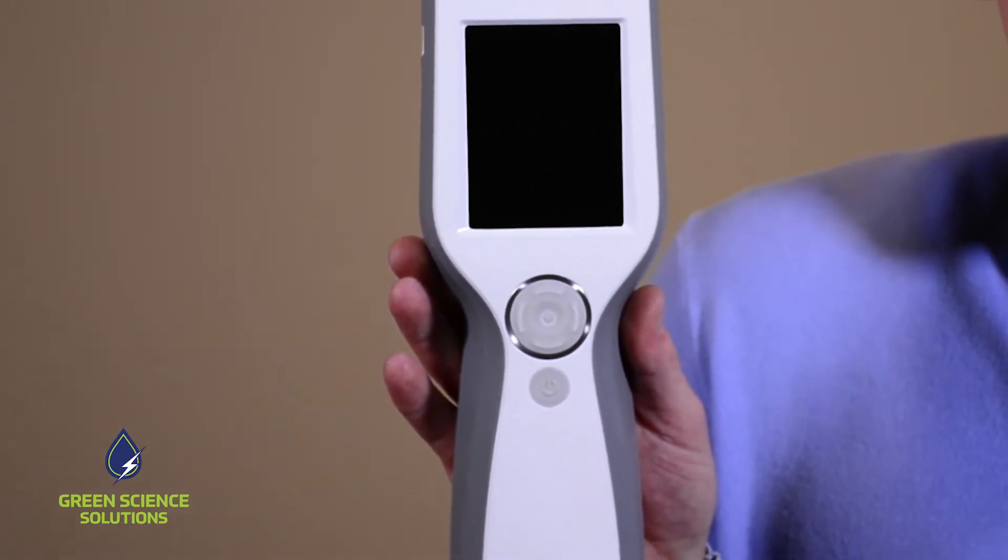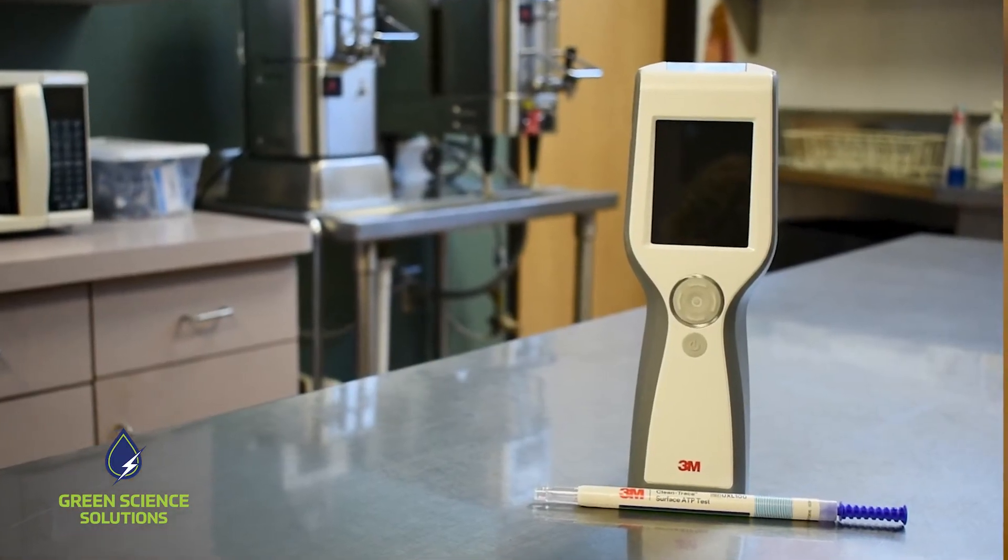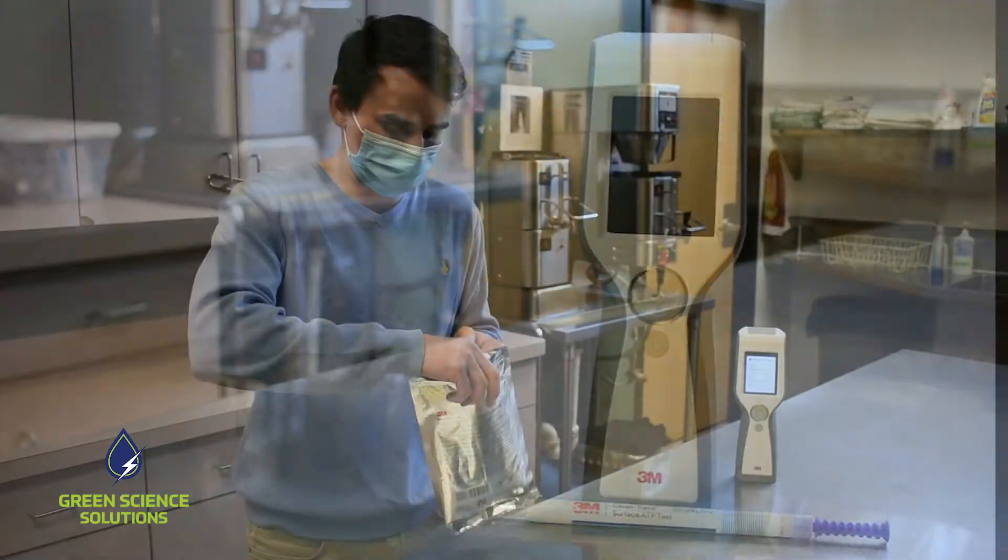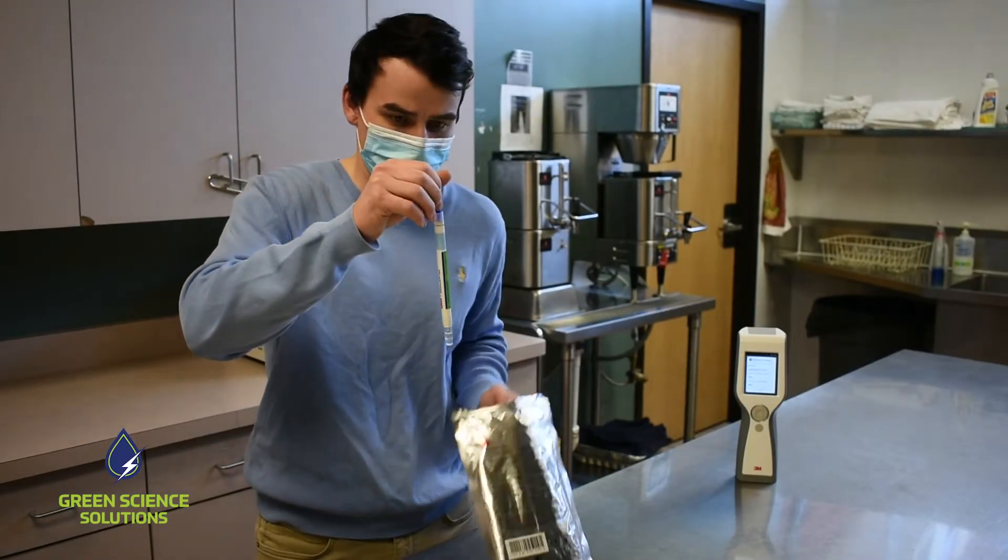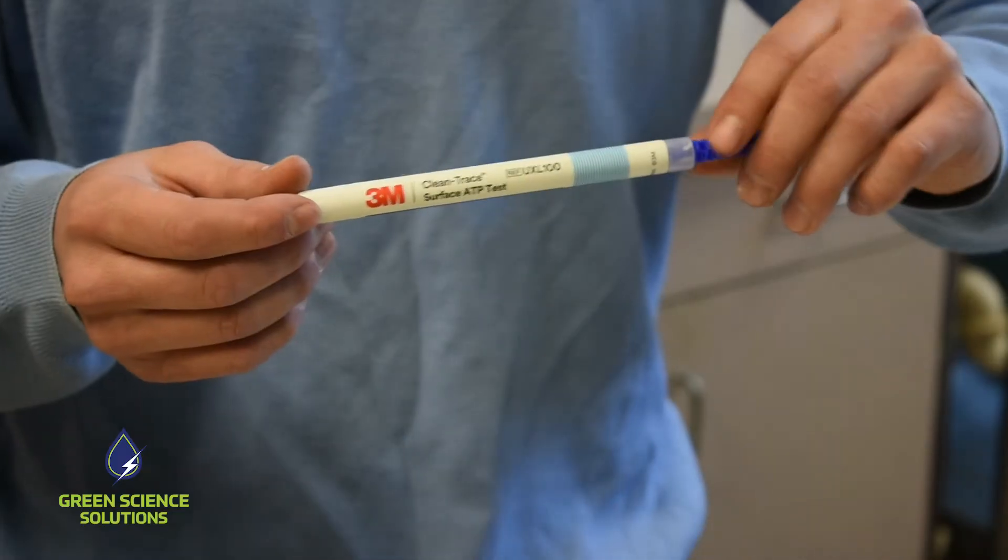Well, we have the perfect answer right here with 3M's ATP meter, also known as the LM1. ATP testing allows you to compare the cleanliness of an area before and after it's been cleaned, and 3M's LM1 is recognized as the most accurate technology in the field. Here's how it works.